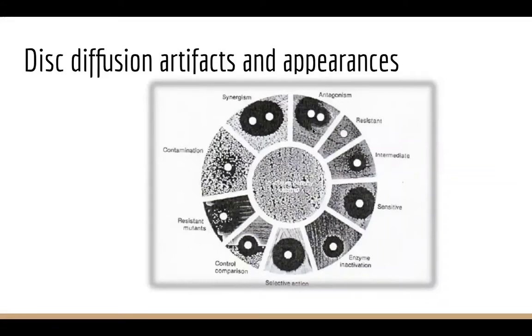So here you can see that the zone of inhibition for this antibiotic would have gone all the way out here, but because there's this other antibiotic, it actually makes it resistant. And you can have an antibiotic which sort of alarms the bacteria to say, hey, look, there's an antibiotic here. And so the pumps sometimes, or the resistance mechanisms which can allow these bacteria to become resistant or to stay resistant are turned on, and then that can make it more resistant to other types of antibiotics. So there's definitely two very different forms of antibiotic interaction here.